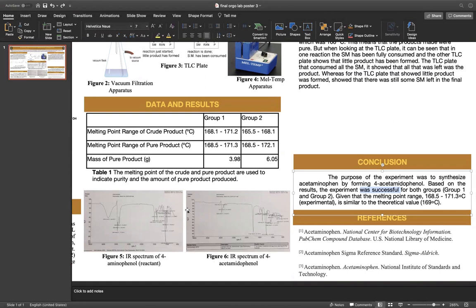No, I mean going to the data bank that we used earlier in the term on week 2 and looking up the spectrum of the product, acetaminophen, and using those data as the reference spectra for the product. Oh, okay, so comparing the spectrum for the product that was obtained during the experiment to one from the data bank. Perfect. Okay, all right, thank you. You are welcome.